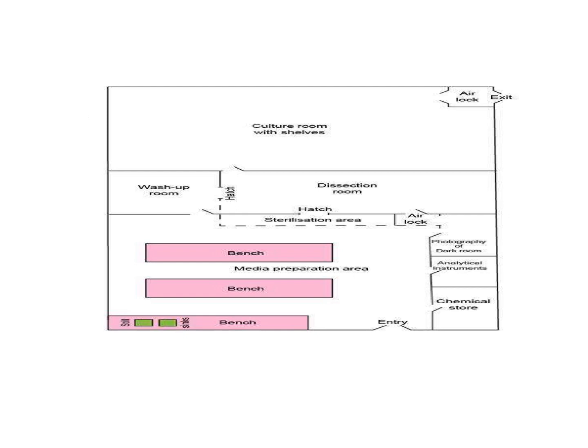And you should have a separate washing room, because we are going to wash fresh or contaminated cultures in the washing room. The washing room should be connected with the culture room or main hall, which is the working area, and also the sterilization area. Then only it will be feasible to wash the things which are urgently required.